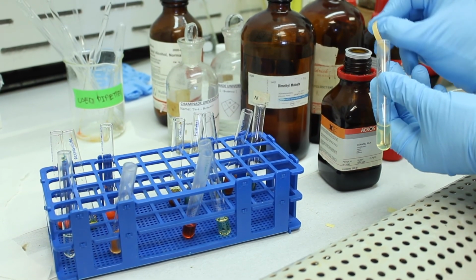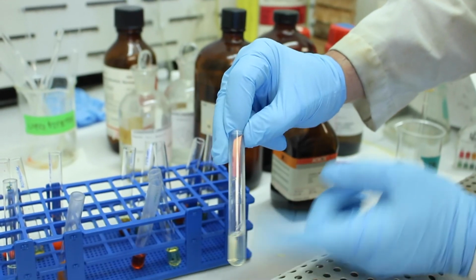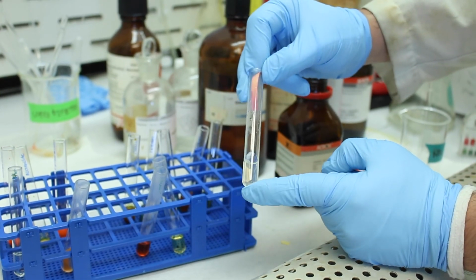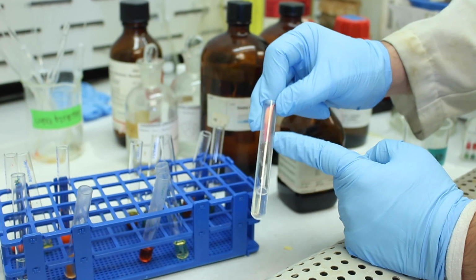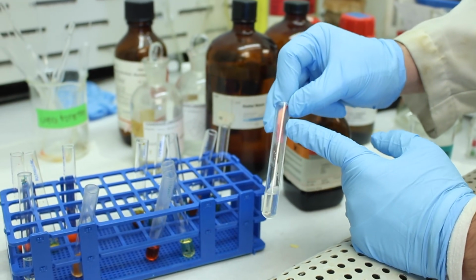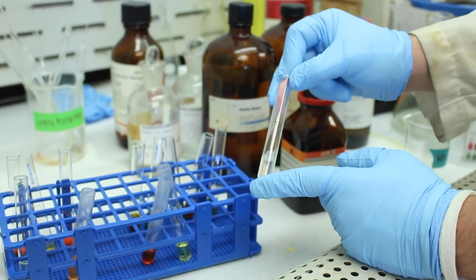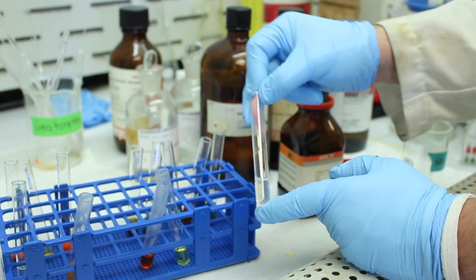Okay, so lightening in color, and there we go. This pH paper is much better. You can see the transition between red and orange. So if you do a bromine test and you observe that it will change pH paper red, that indicates the presence of HBr. And if there's HBr, we can suggest that the double bond that's substituting is existing within an aromatic ring, and that ring probably has a donating group.